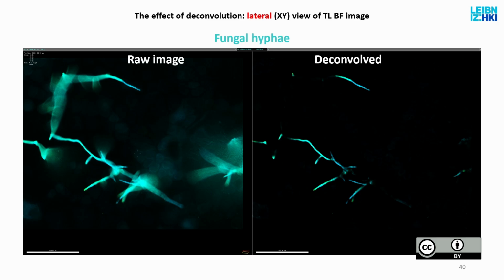This is the same image as on the left side after deconvolution. Here, the microscopist didn't have to do anything other than collect these images and give them to us, and then we deconvolved them using a theoretical point spread function, and we got an image which is now perfectly analyzable. If you try to analyze this, you will fail because you don't even see the object.